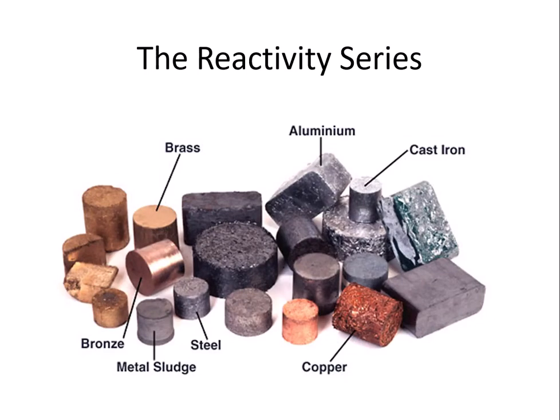In this video, we're going to do a little reminder of the beginning of our booklet on reactivity series. So we're just going to go through a few of the reactions and I'll demonstrate on video some of the reactions of these metals, and we're going to look at it in terms of the reactivity. Now, metals, as we talked about, come in a variety of different types and have different ways in which they react and different abilities to react. So some are more reactive than others, and some will be obviously less reactive.